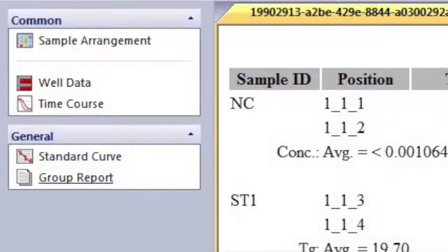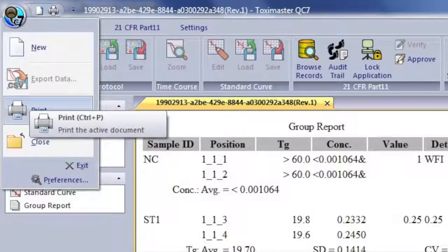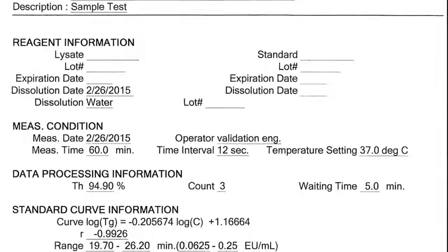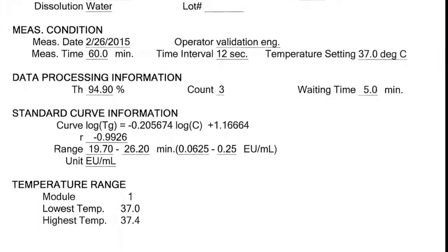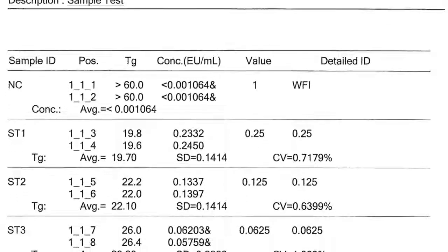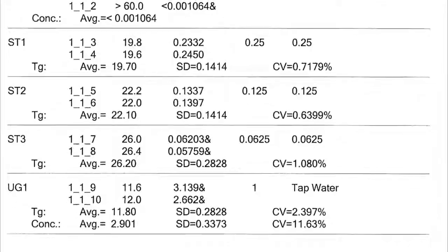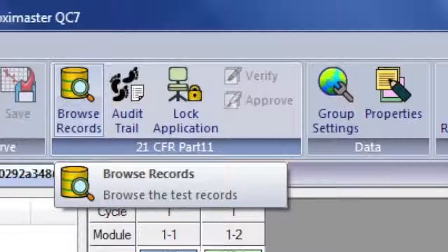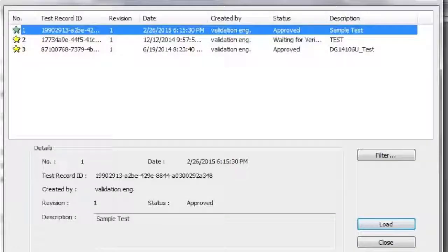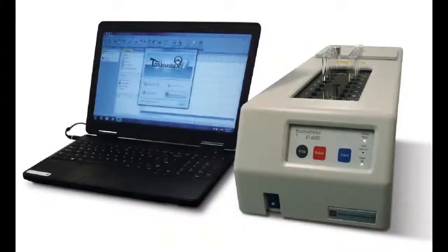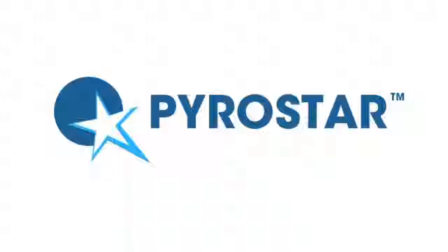You may also select Group Report for printing all information about the testing samples. As well as for the Group Report, if reagent information was entered when the sample was arranged, it will be printed within the General Group Report. Use the Browse Records button to find previous testing results. These reasons and more are why you should select WACO Chemicals USA as your LAL provider.